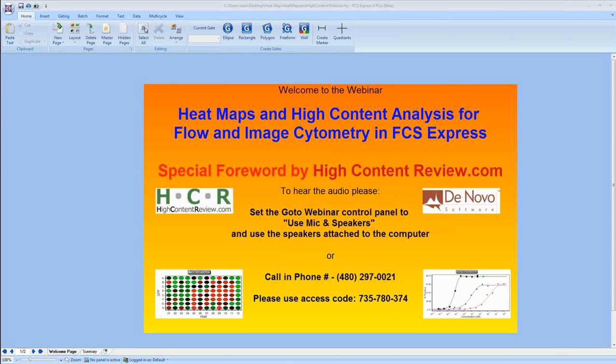All right, so today we're going to be talking about heat maps and high content analysis for flow and image cytometry in FCS Express. We also have Cindy Hazuka on the line from highcontentreview.com. Cindy's going to take a few minutes and tell us a little bit about highcontentreview.com. It's a great resource for those of us in the high content world, whether it be flow or image cytometry. So Cindy, let me make you the presenter, and maybe you could tell us a little bit more about that.